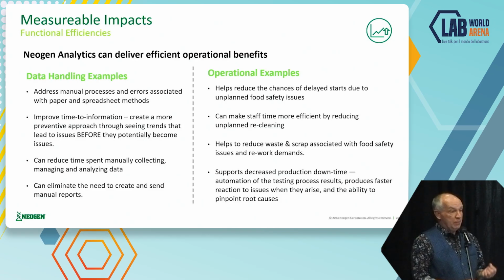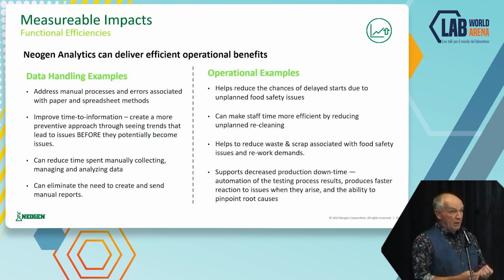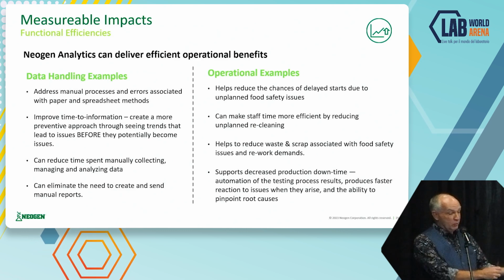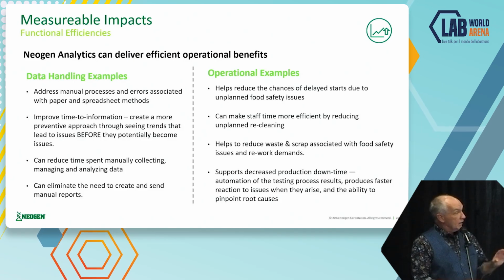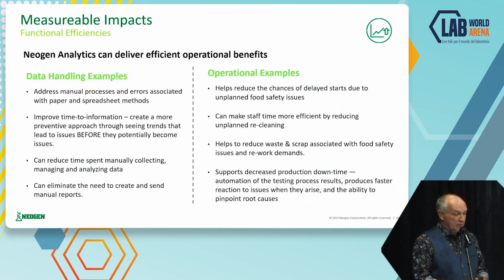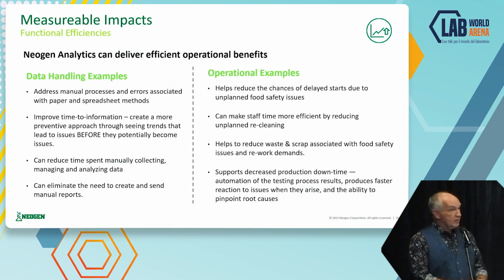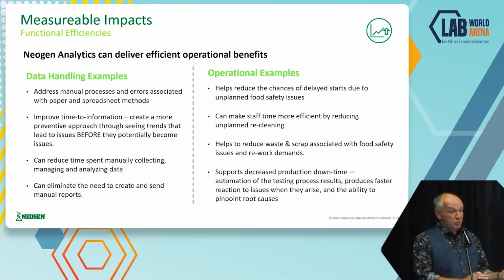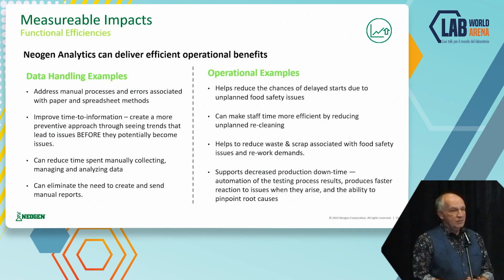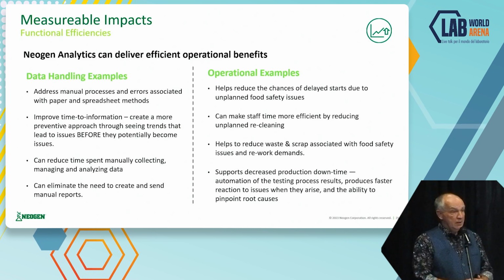Don't spend so much time on manually collecting and documenting data, because there's also a high likelihood of errors if people write down information and have to read it and have to report it. So we get the data more and more automated, so that we can use it as information and driving actions. So these are some examples, and I would be happy if every company would do this today. But here are some examples coming from industry, translated into products, translated into processes that we use to help companies to make their work and their lab work much more efficient.